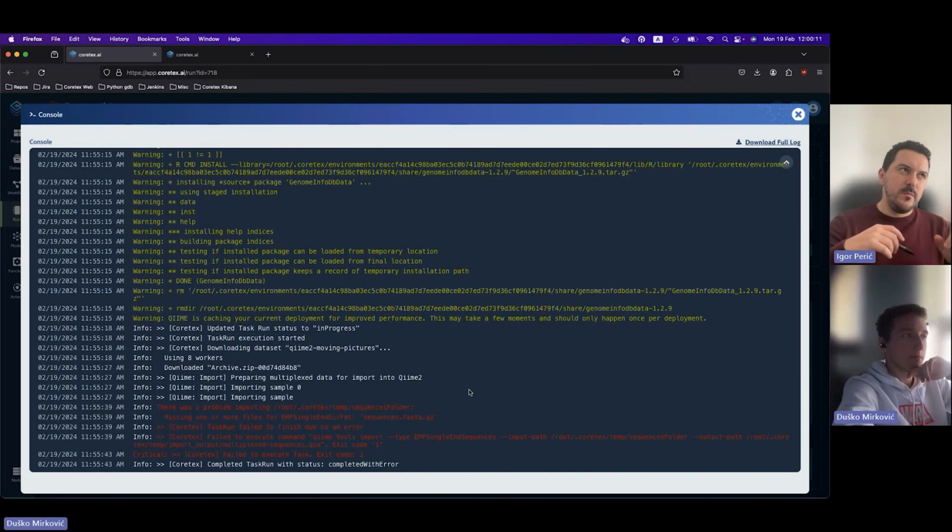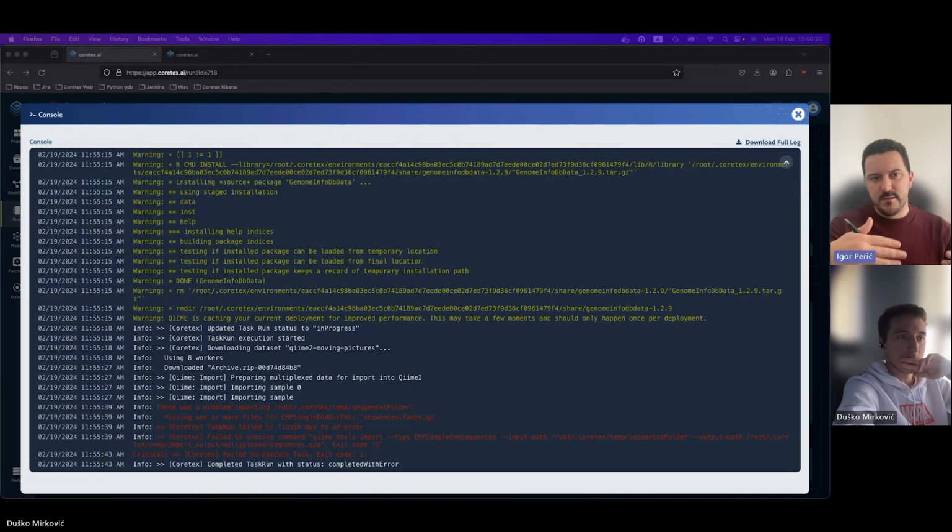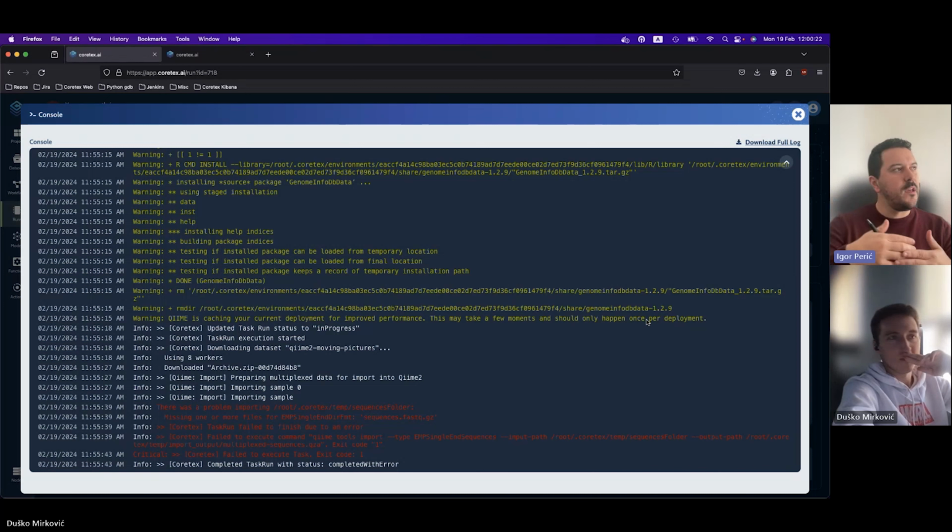So it will reuse Python environments between multiple runs if you don't destroy the file system, so to speak, right? If there's a persistent mechanism of storing, like in this case, because I'm asking because it's a cloud queue. So the machine you just ran it on, it got killed, right? Yeah, so if the same machine isn't started, then yes, it will not use the cache.